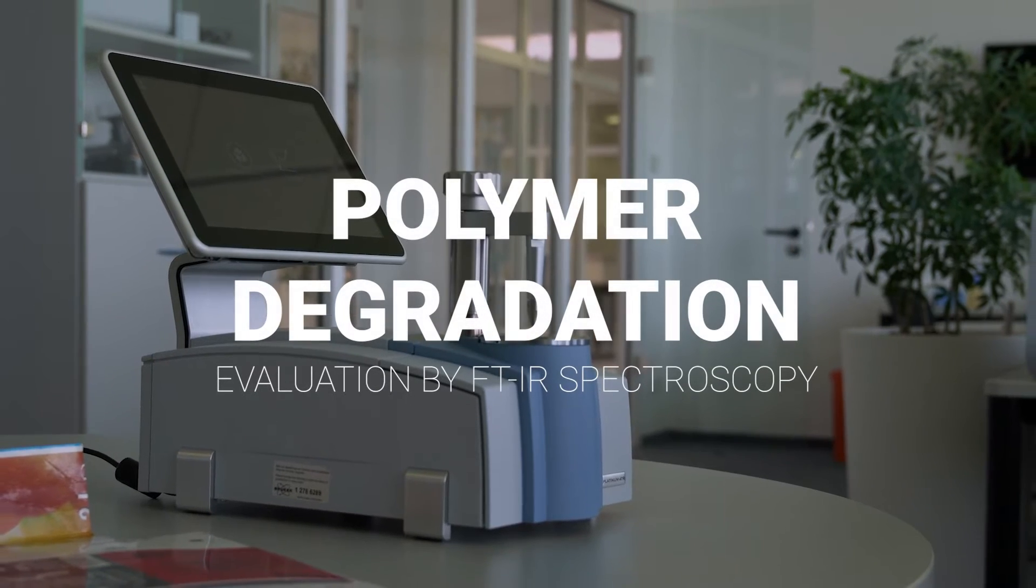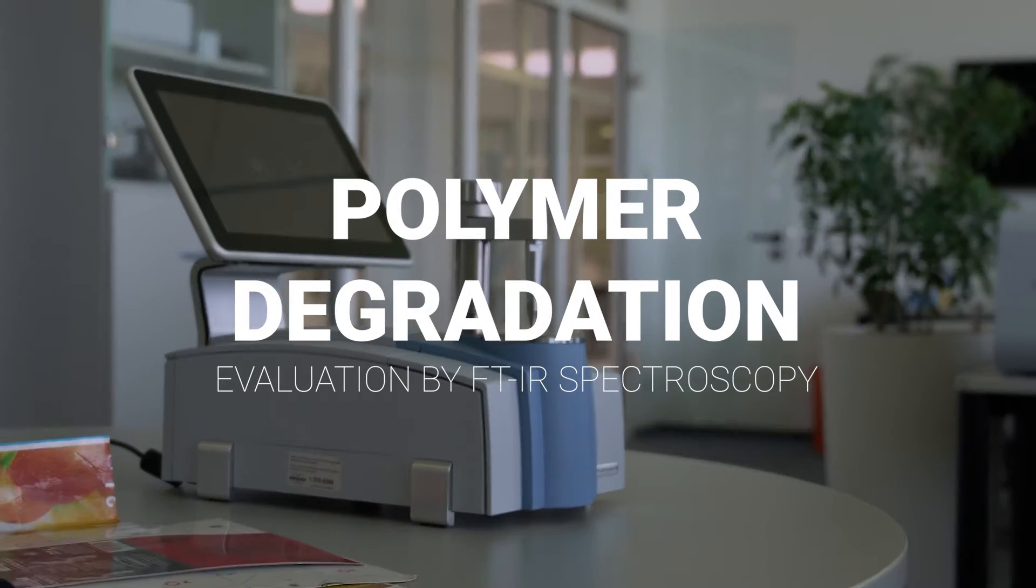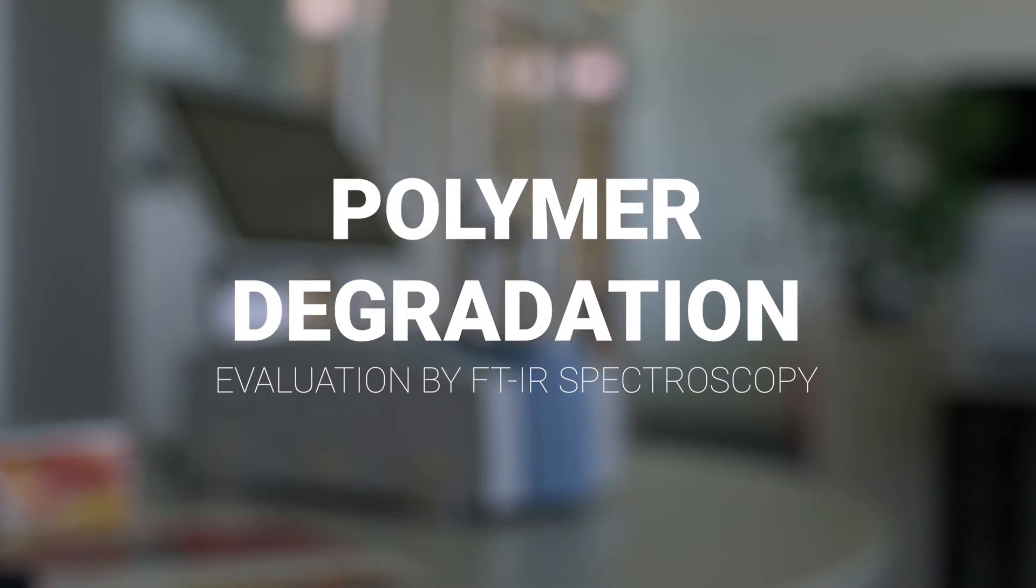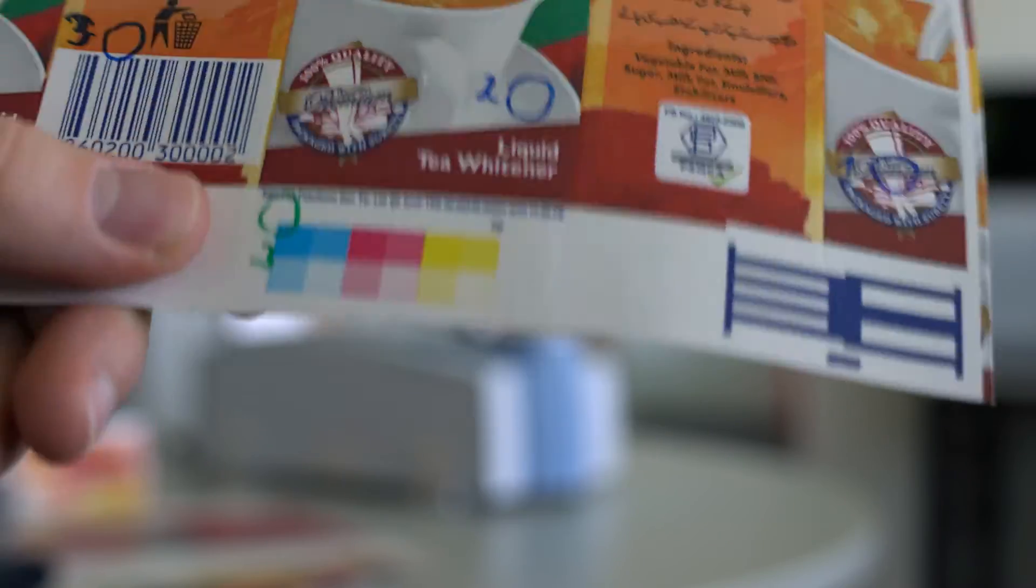Monitoring polymer degradation in food packaging by FTIR Spectroscopy. Food packaging like this milk carton undergoes several production steps.